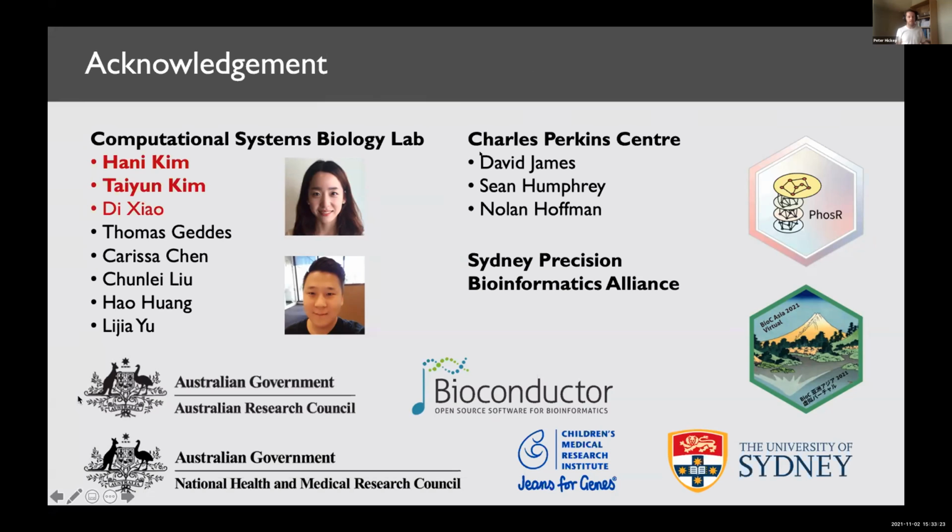Thank you, Pengyi, for your talk, and thank you again for switching slots. Just a quick question from me so that we can give Mahmood time to talk. With the RUV results, it looks very impressive for the normalization or batch effect correction. I've applied it to gene expression data, and one of the challenges there is in choosing how many unwanted factors to use. How do you approach it for this type of data?